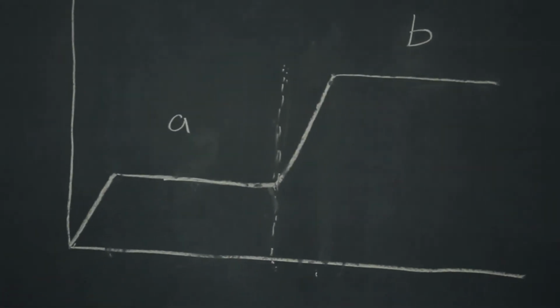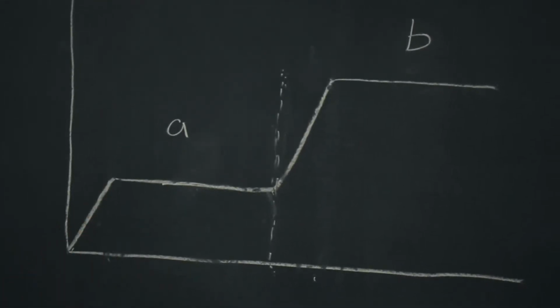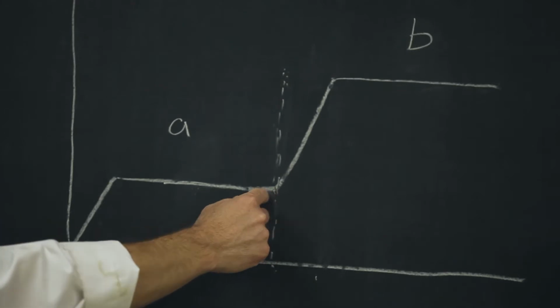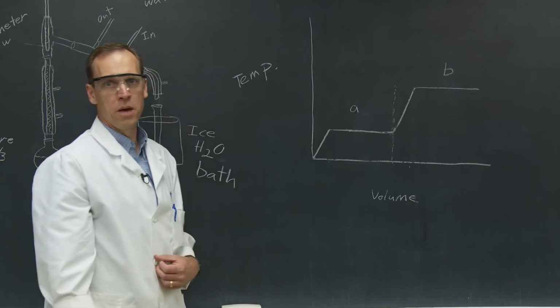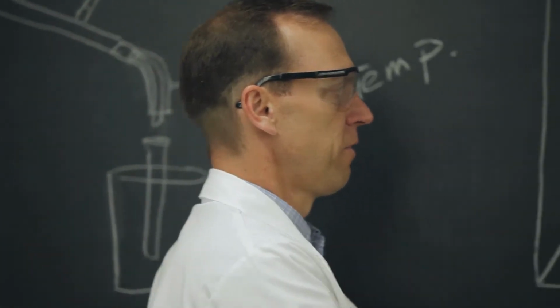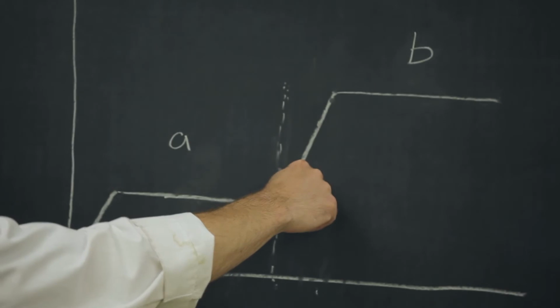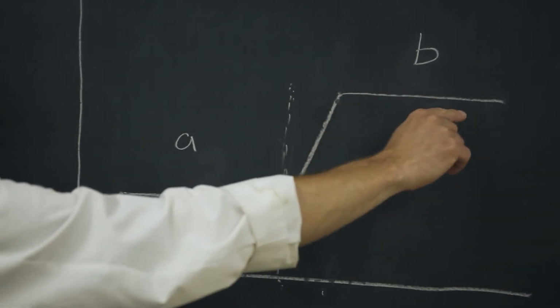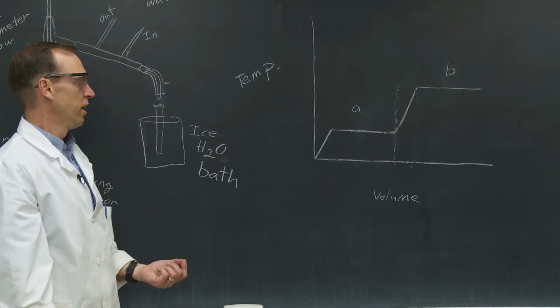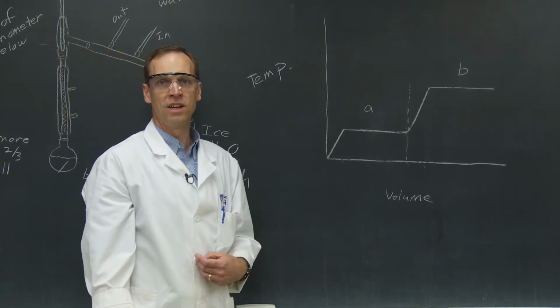So with your distillation, as you start out, I take the first few drops of A, put it in a separate test tube, and then collect all of the remaining of A into a second test tube. This represents a more pure sample of A for your analysis by the refractive index. And then same thing for B. Take the first few drops of B, put this in a third test tube, and then after that, everything else in there should correlate to component B. And so you should end up with two fractions that are relatively pure for your refractive index analysis.